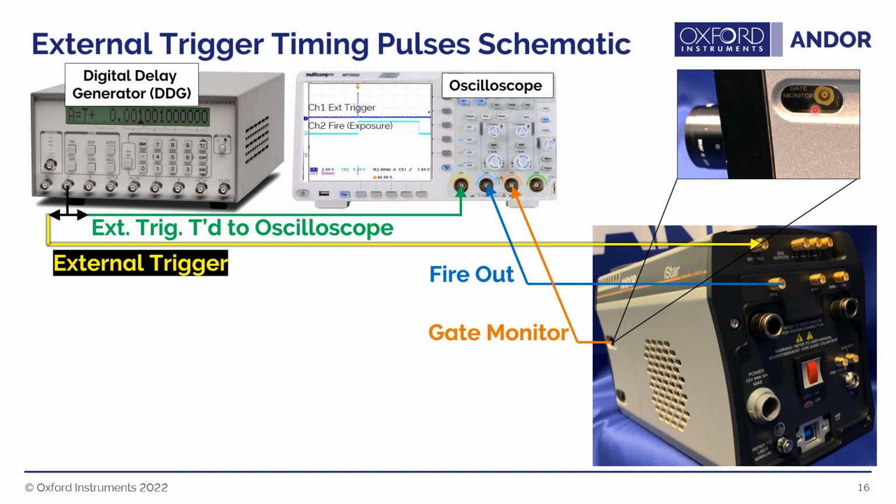So the clever engineers at Andor used the concept I was describing earlier, of having a high voltage pulsing wire next to another wire to pick up the signal that gets sent to the oscilloscope. They put a wire right next to the photocathode, and that sends the signal in. You can see that it's not a perfect TTL rectangular shape, but that's okay, because really we want to know when the gate is opening and when it is closing.